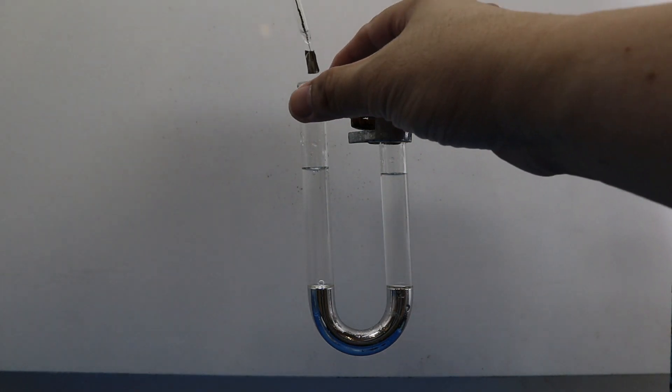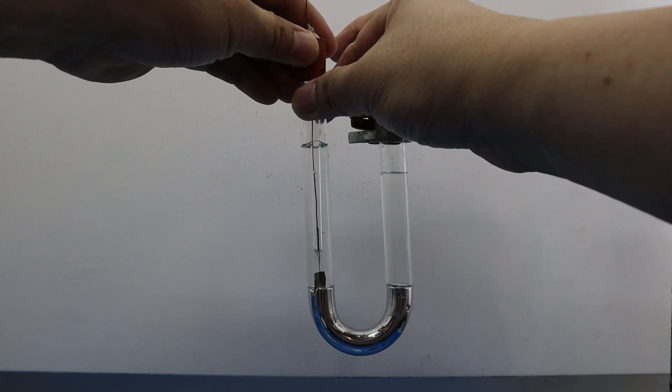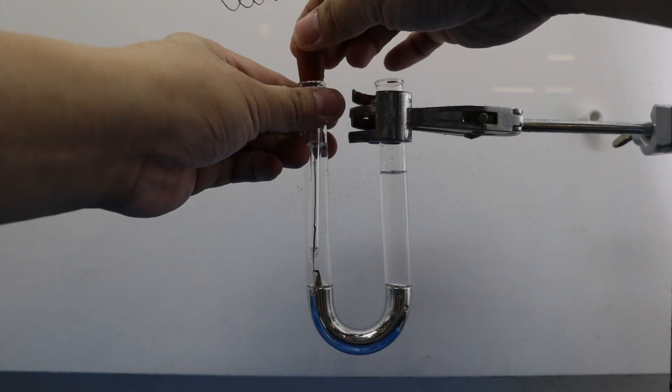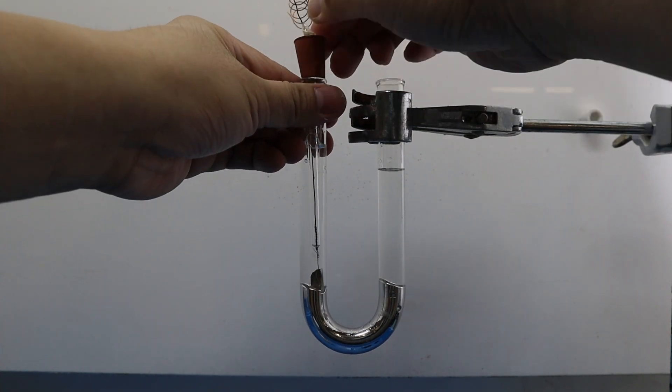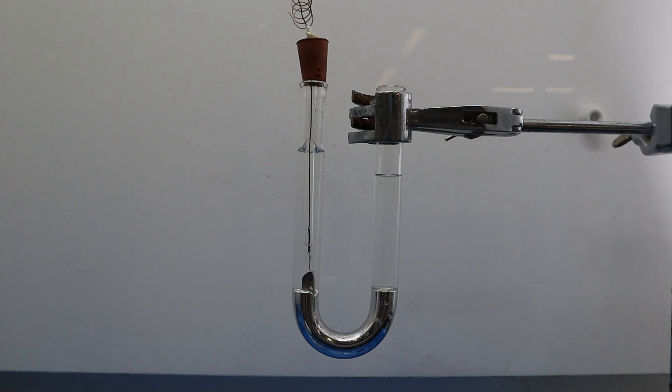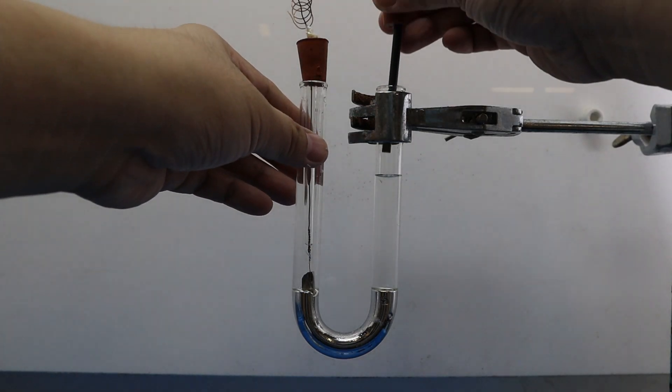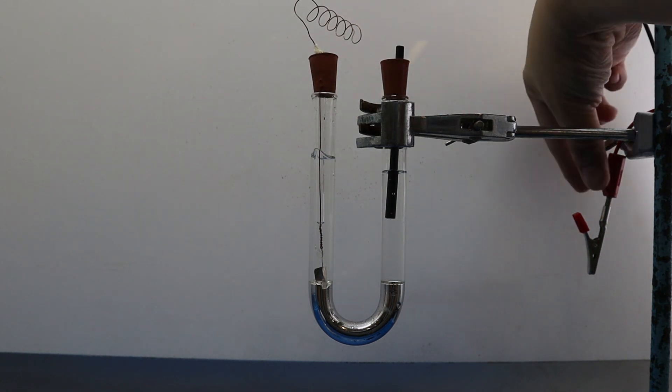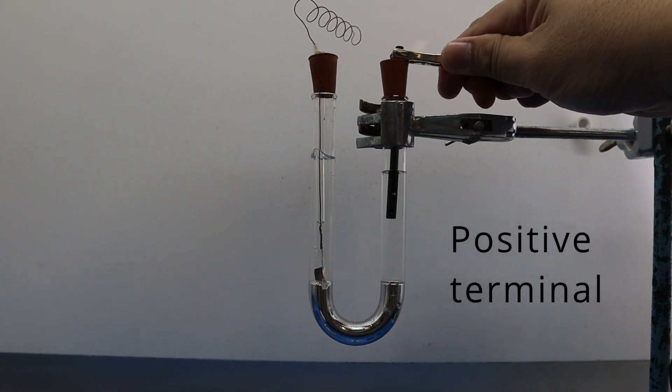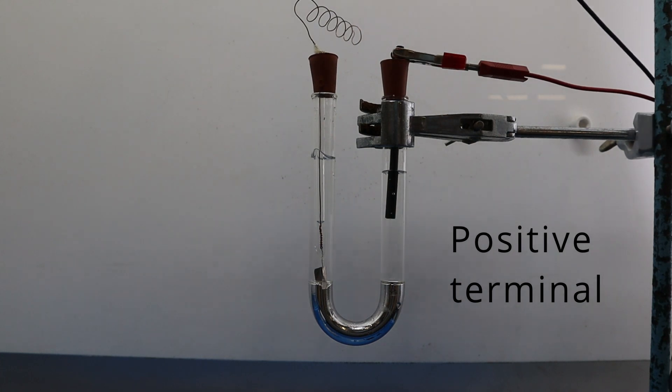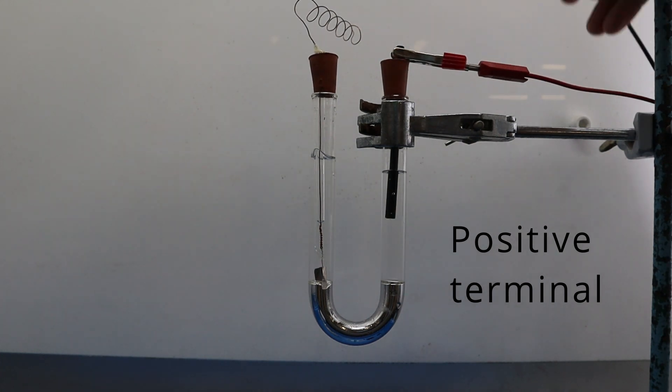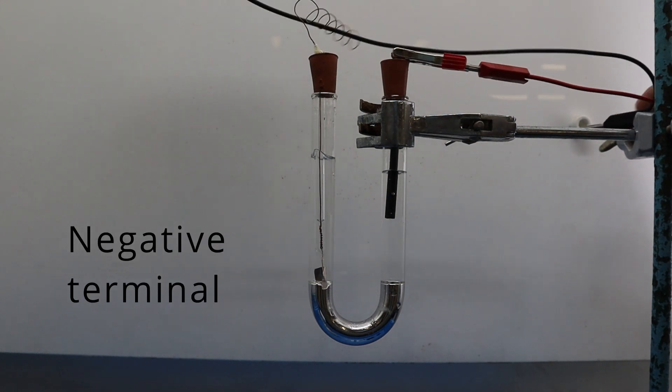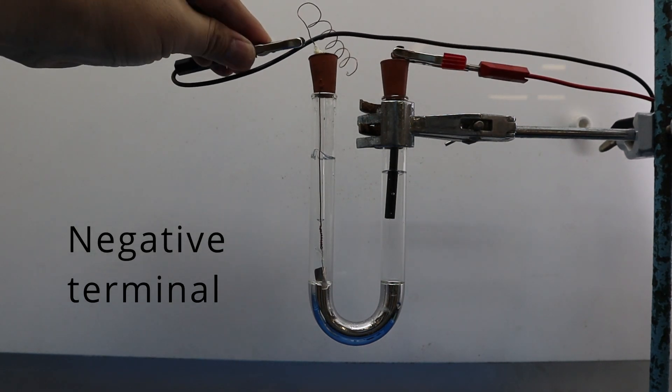Then a platinum plate is connected to the mercury through the deionized water. A graphite electrode is put into the sodium chloride solution. The graphite electrode is connected to the positive terminal of the power pack. Mercury is connected to the negative terminal of the power pack.